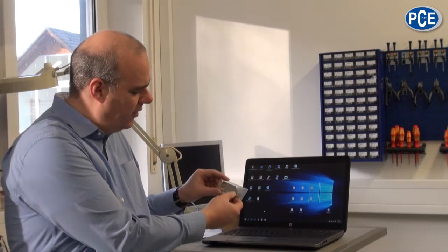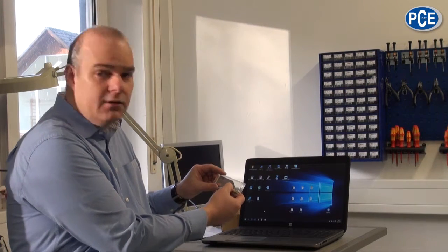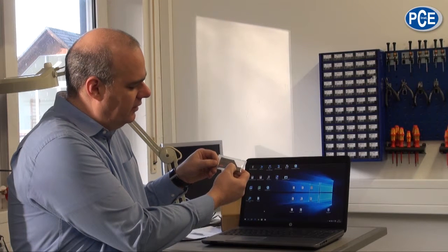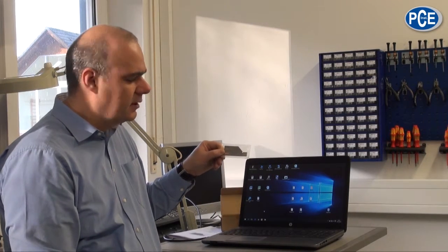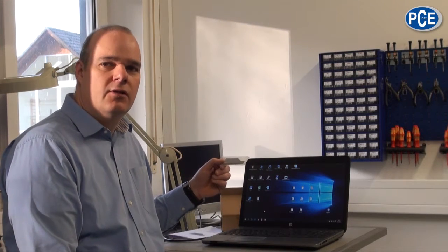I have to activate it first. That means I push this button and it starts to light up green. That means it is activated. As you can see, here it is green and I can see, okay, everything is okay. I can put it into my package, and when it arrives in say 3 days, the person takes it out, puts it into the computer and reads the data.